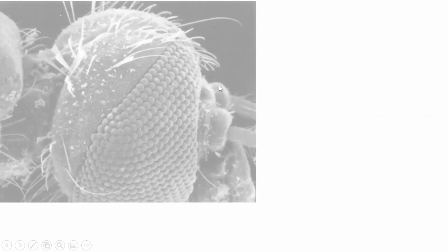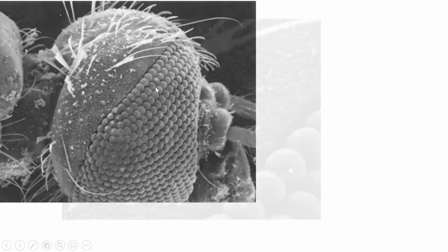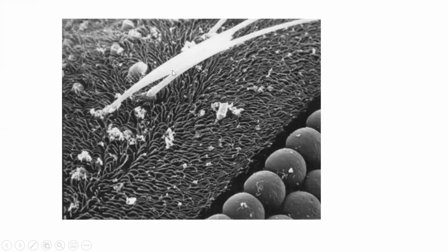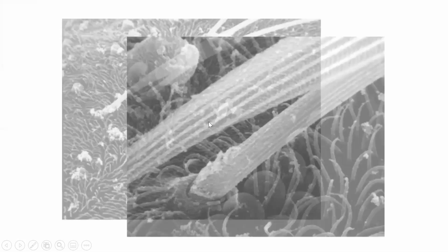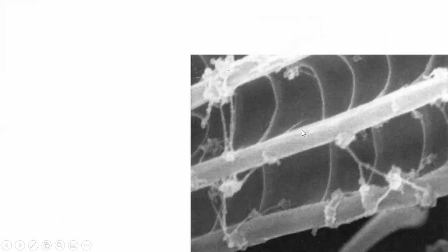And then here's some images. You can see there's the insect's head. You can make out all those individual hairs, and you can zoom in. We're zooming in on some hairs there. Zoom in a little bit more, and we're making out some details. And these little things here are actual proteins on the hair. So it's just incredible. Look at those proteins, the detail we can get compared to something like a light microscope. Just absolutely remarkable.